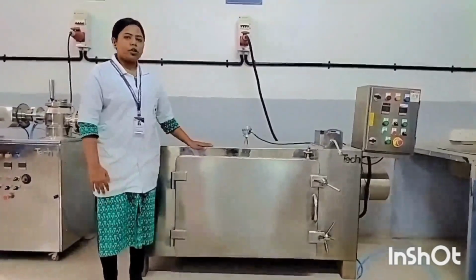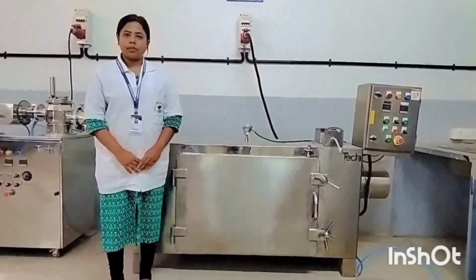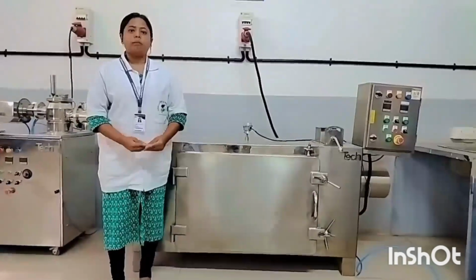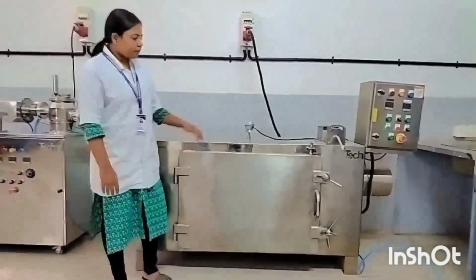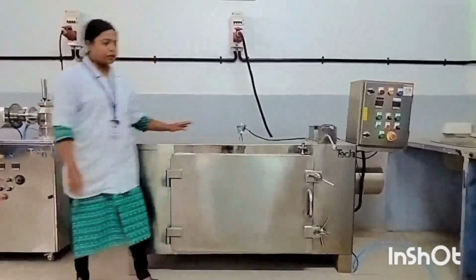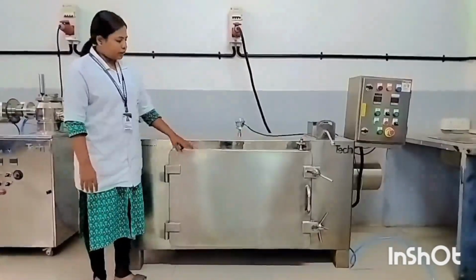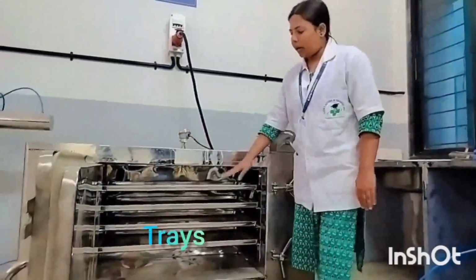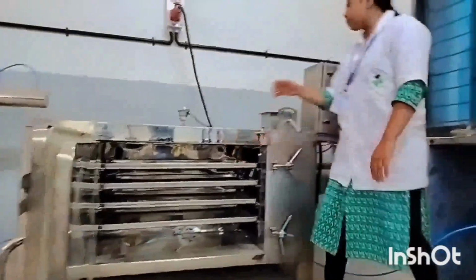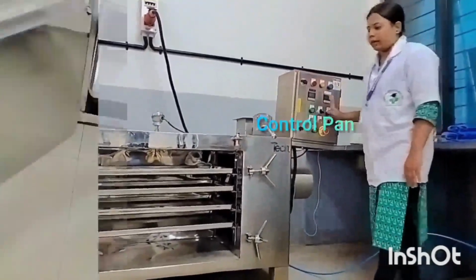Today I will introduce you to tray dryers. Tray dryers are used to evaporate or sublimate liquids or moisture from bulky solids, powders, components, other materials or liquids. Tray dryers are enclosed insulated chambers where trays are stacked in trolleys on top of each other. Heated material to be dried is placed in the trays. Outside is the control panel, which is used for controlling the temperature and time.